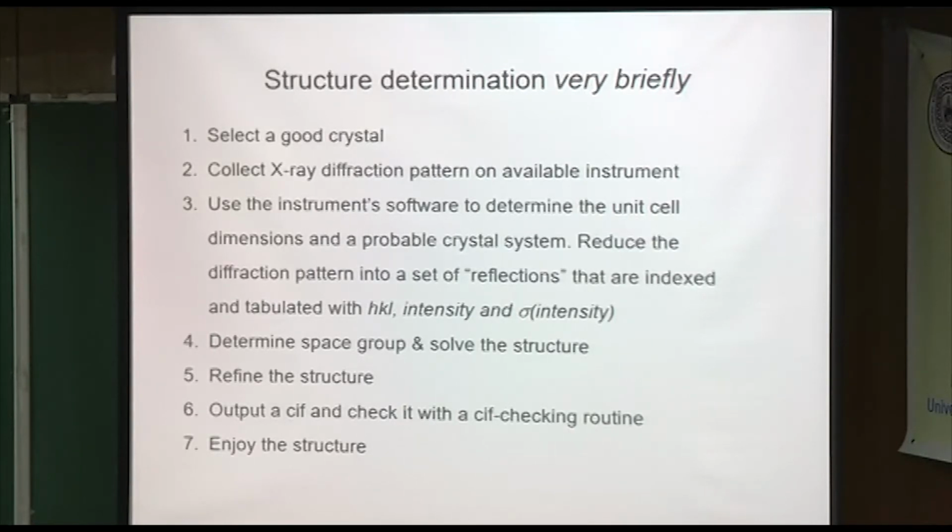Anyway, once you get the checking routine to say you're done, or you've satisfied it that you've thought of everything, but there's just some things that won't go away, you're sorry, but the beam stop was in the way, or something like that, some excuse. Meanwhile, you're graphically enjoying the structure. I think it's an awfully important step. I should have put it in here.